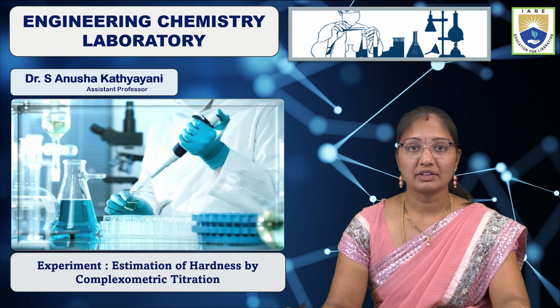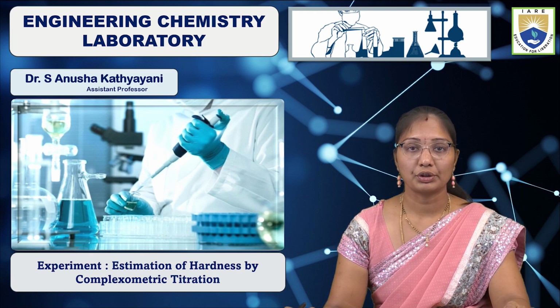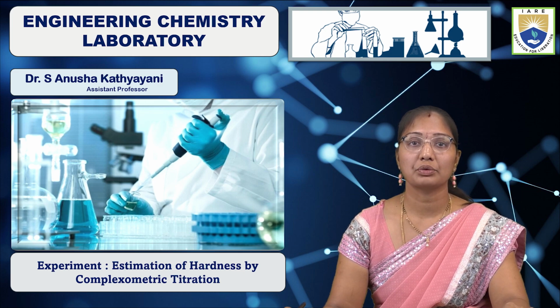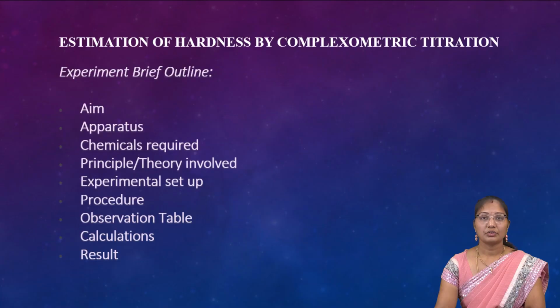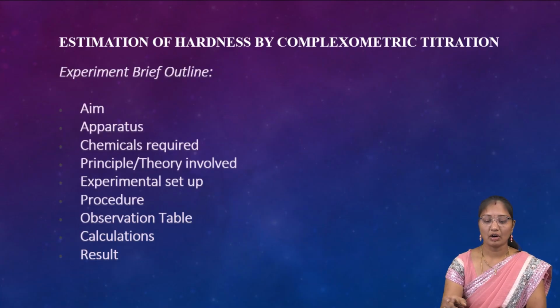Today, I am going to discuss the demonstration of hardness of water. How we are going to measure the hardness in water by using complexometric titration. It is a laboratory experiment in engineering chemistry. So, here is the estimation of hardness by complexometric titration.